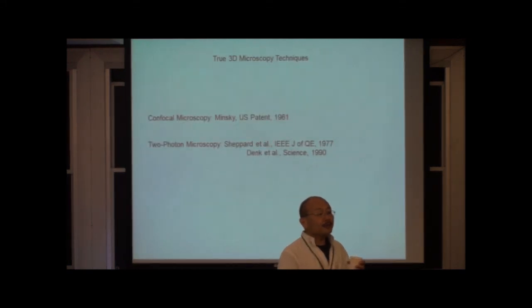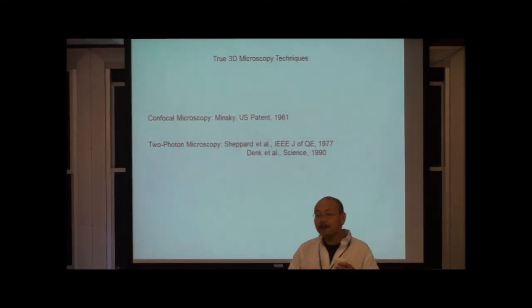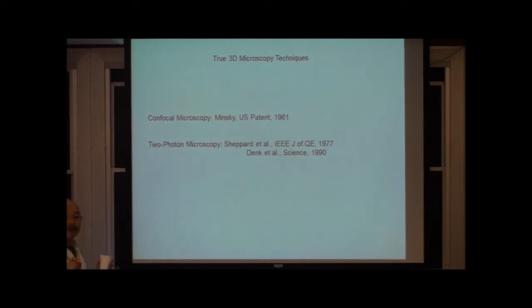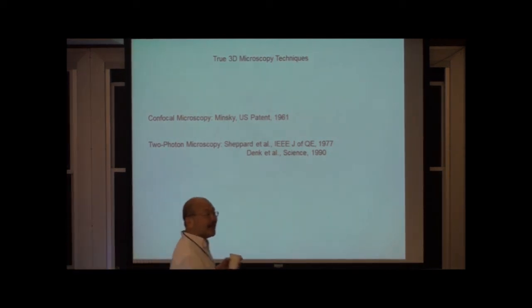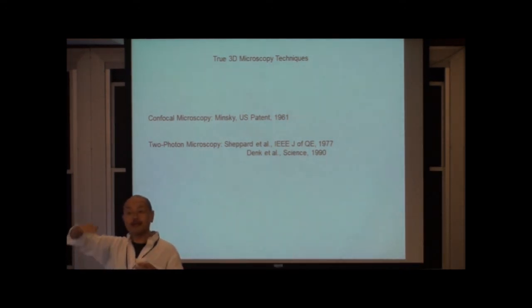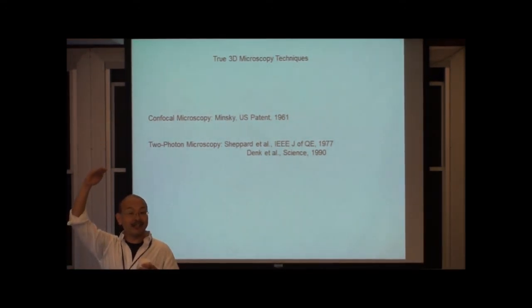So one of the things to remember is your wide field microscope does not have three-dimensional resolution. If you remember, what you did is you focused the light at the back aperture of the microscope. And if you remember Steve's lecture, if you focus the light at the back focal point, the light becomes collimated after the objective, which means that your sample is uniformly excited at every depth.